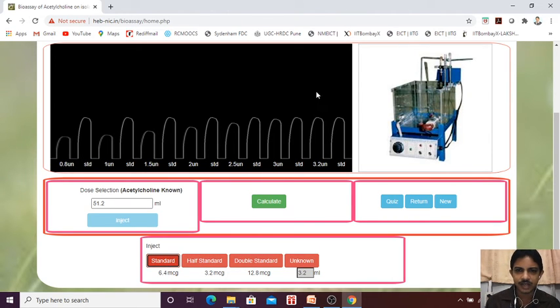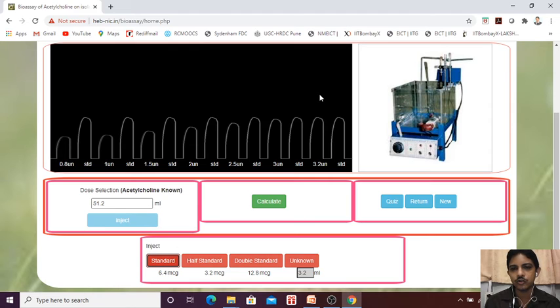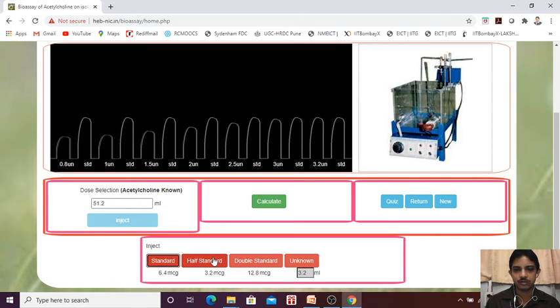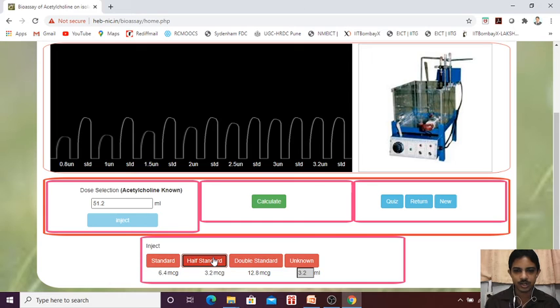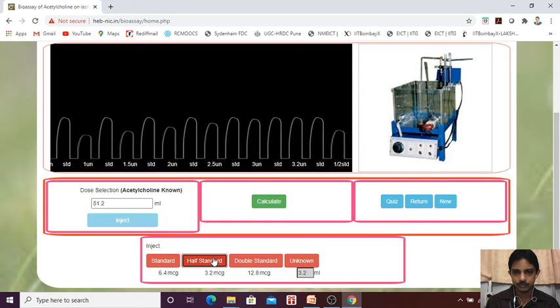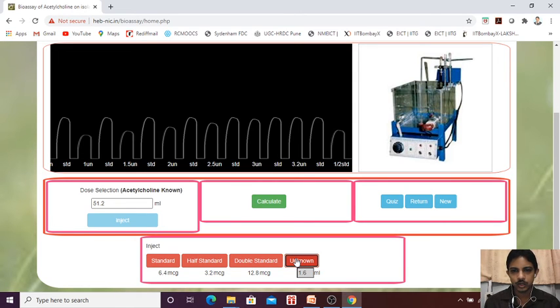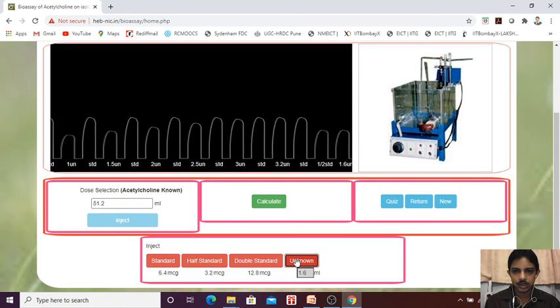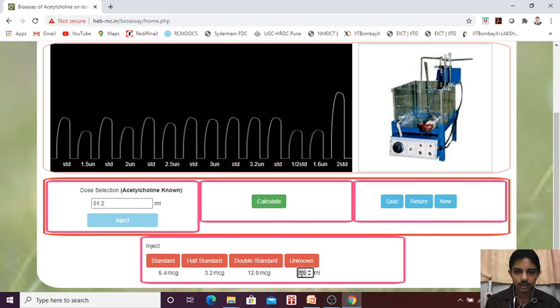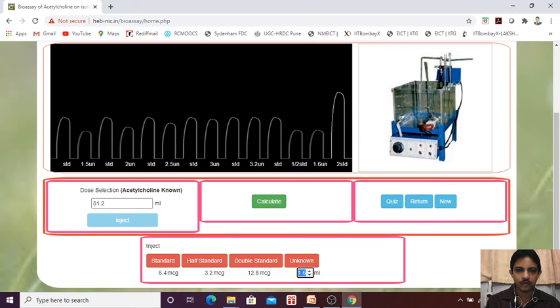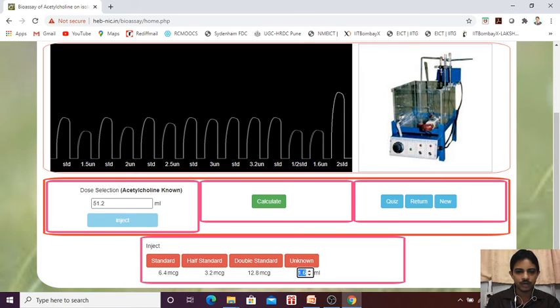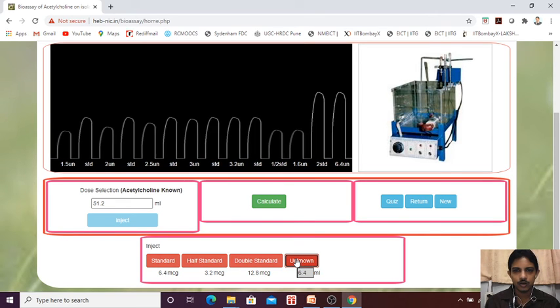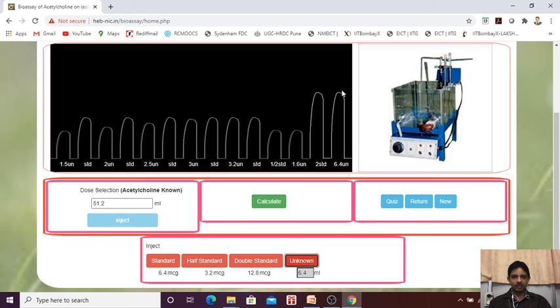Again you need to reduce the concentration. You need to reduce the concentration. So what you can do? Half standard. We will give the half standard. If it is half, you should decrease the dose also half. So here also it is matched. Here also it is matched. We will give the double. We should give the, what we have got 3.2, so double of 3.2 is 6.4. So unknown is 6.4 ml. See, now it is matched.